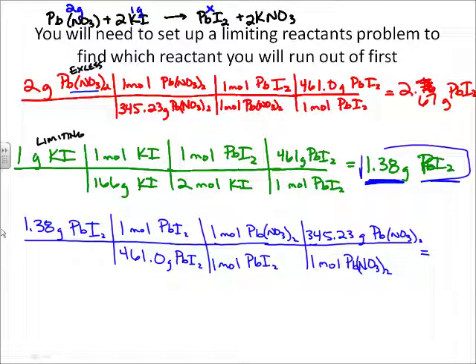By this calculation, we're going to find out how much of the lead-2 nitrate we used up.